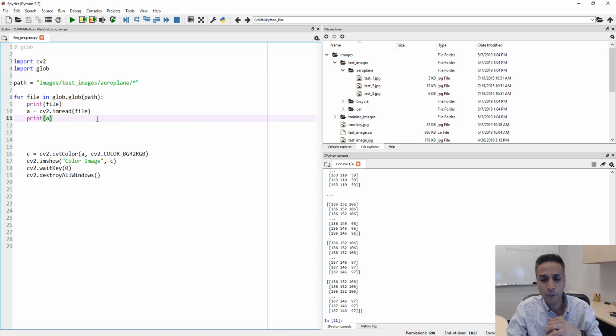We also looked at a couple of proprietary or non-standard image formats and how to open them. And again, Google search is the most powerful. If you don't know something, just go there, search for it, and chances are you'll find a solution online. That's exactly how I learn pretty much every day.